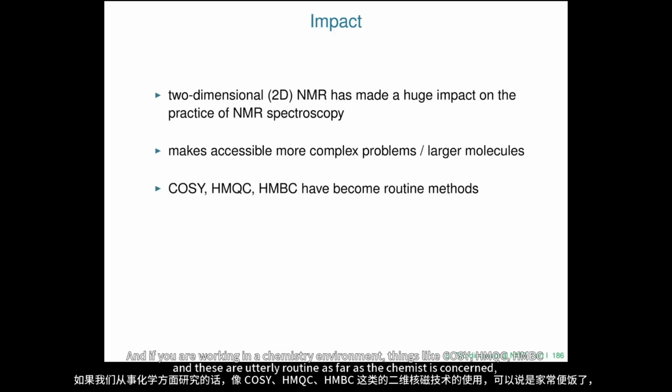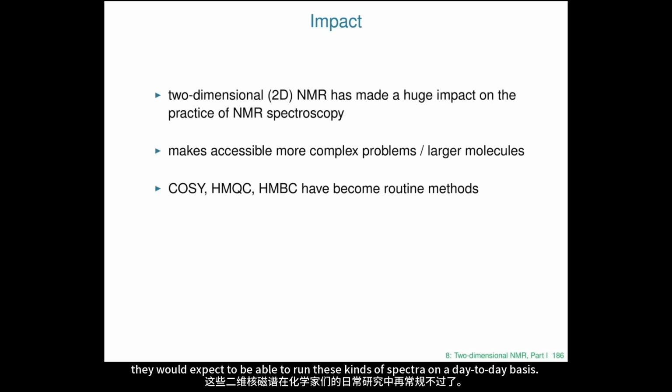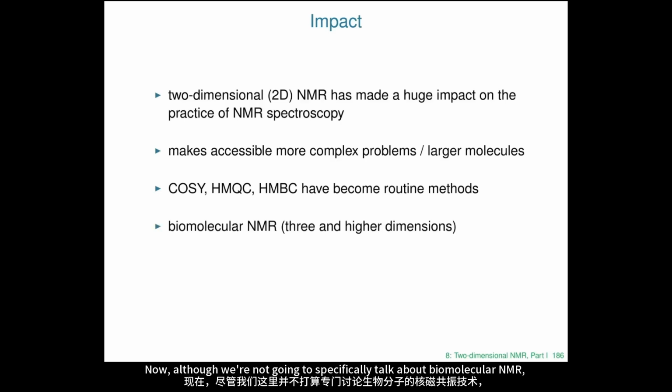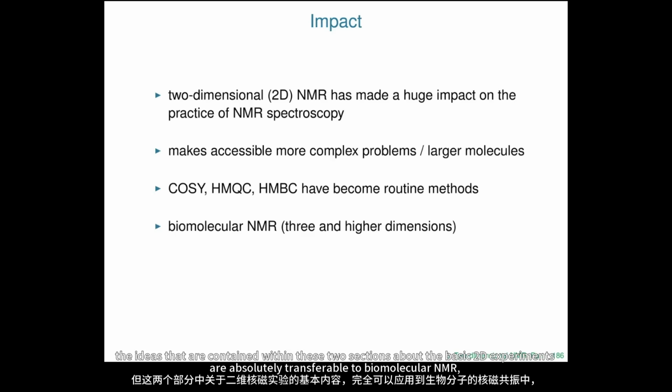And if you are working in a chemistry environment, things like COSY, HMQC, HMBC, I mean, these are utterly routine as far as the chemist is concerned. They would expect to be able to run these kinds of spectra on a day-to-day basis.